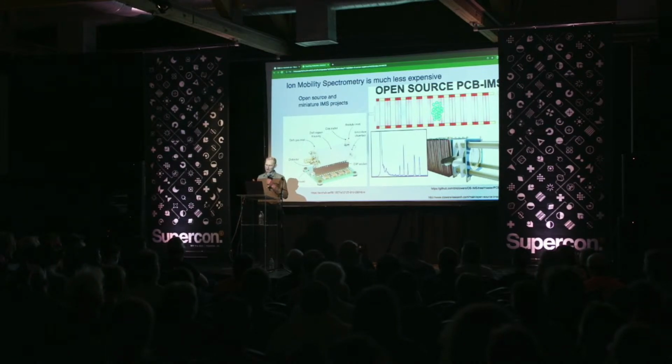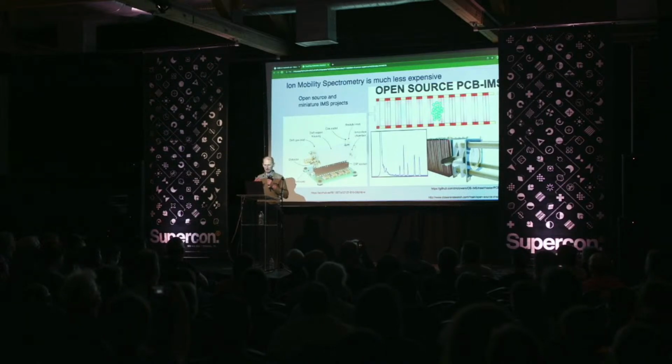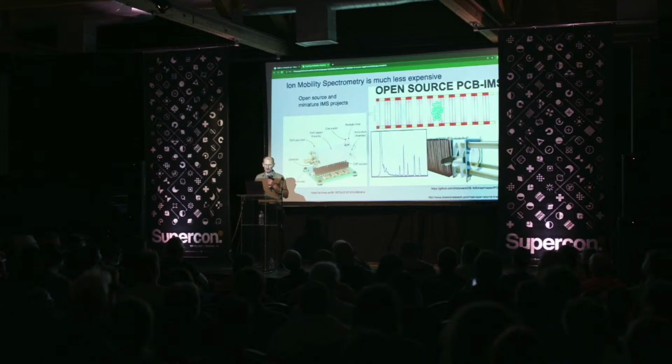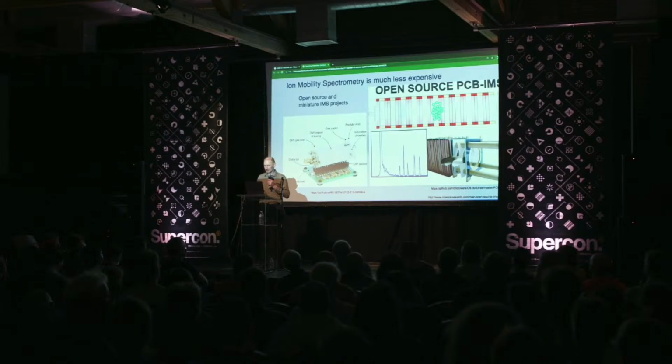And so kind of my pitch in this whole presentation is just that the more accessible and cheap lab equipment can be, the more experiments will run just because the equipment is available, and the more stuff we'll discover. If everyone had a mass spec, that would be great, but they really are just too expensive and difficult to use. A cheap detector, you wouldn't feel bad about taking it out to the pond and just sampling things, because if it breaks, it's maybe a few $100s. And this open source design is absolutely in that price range.